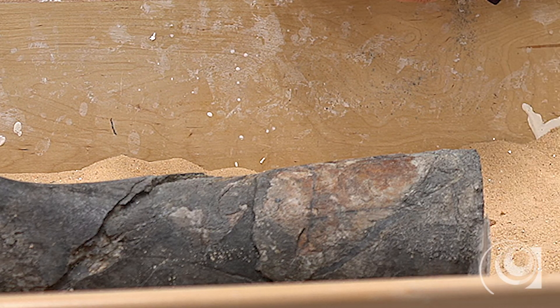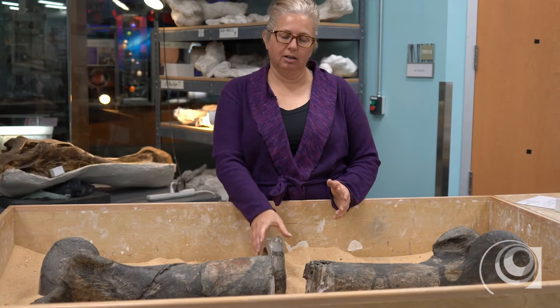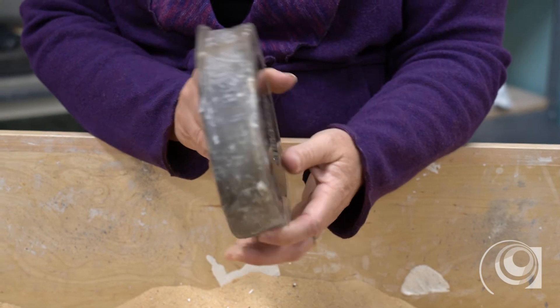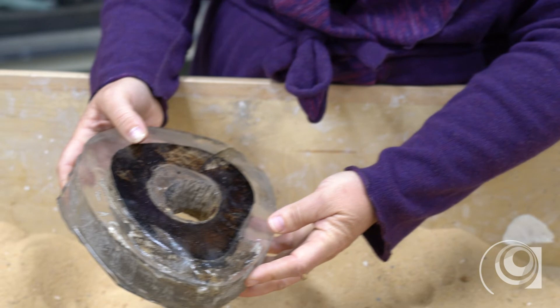I've already gone through the first step of this process. I cut the bone in half and then cut a section out of it — and here's what it looks like now. After the section was cut out, this little slice, I embedded it in a clear epoxy resin for stability.